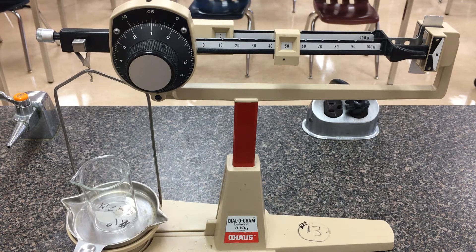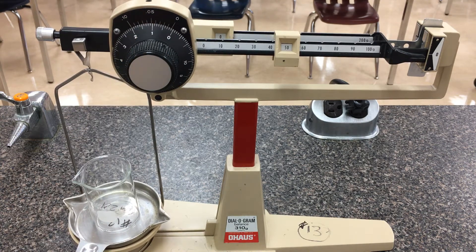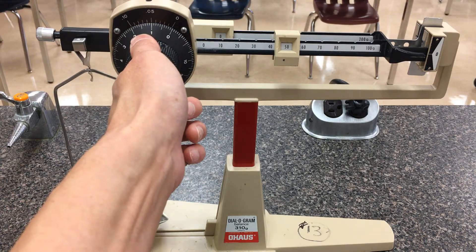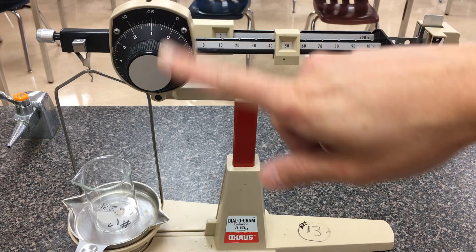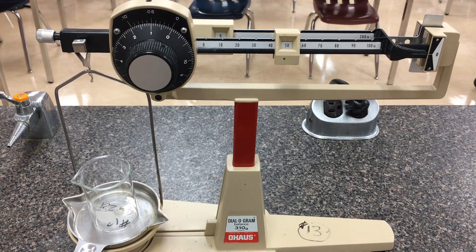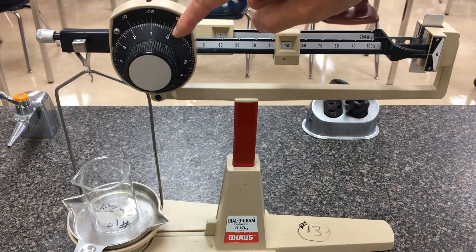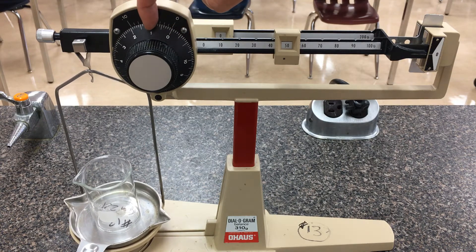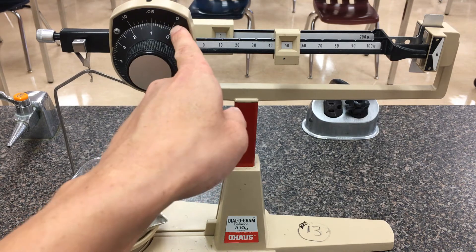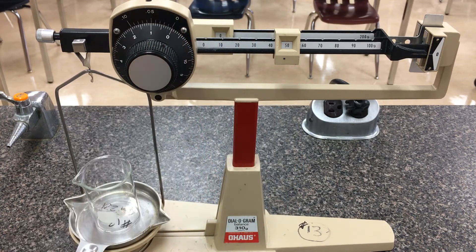We assume the scale was calibrated to begin with, then we counterbalance it. Reading the mass: from the back beam we know we're not quite 100; from the second beam we know we're at least 50. The tens position is read directly from the second beam — so it's 50. If the wheel were at zero it would be exactly 50.0; if it were at the one mark it would be 51. So we have 50, and we use the markings on the wheel itself to tell us the first decimal place. The zero mark is point zero, the next is point one, and I'm somewhere between point zero and point one, so so far we have 50.0.